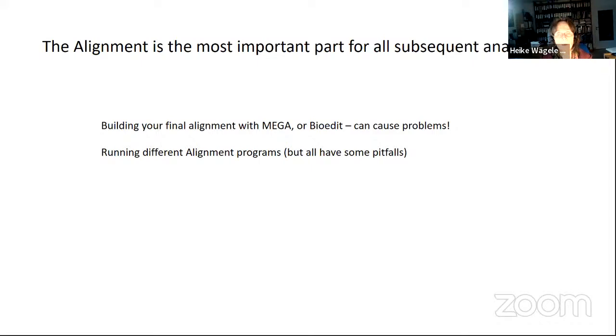On these repositories, these sequences you should also use when you analyze your own sequences. So you should never analyze only your sequence and say something about only your sequence. You always have to analyze your sequence in combination with published data, that means with sequences from these repositories.